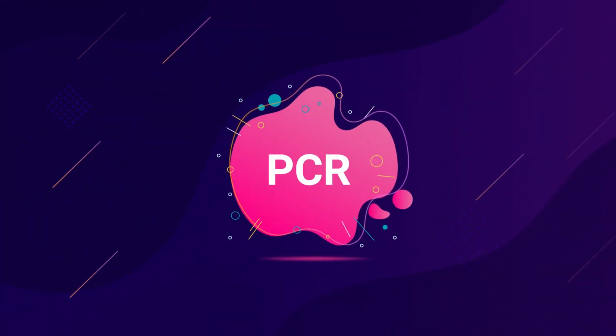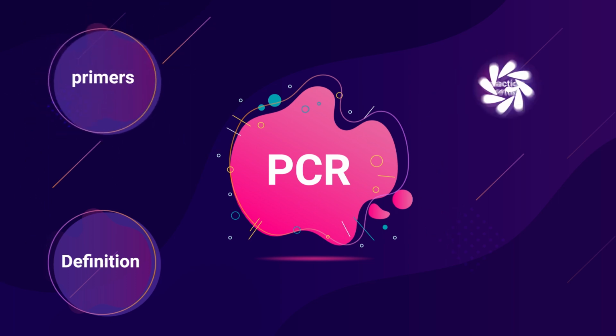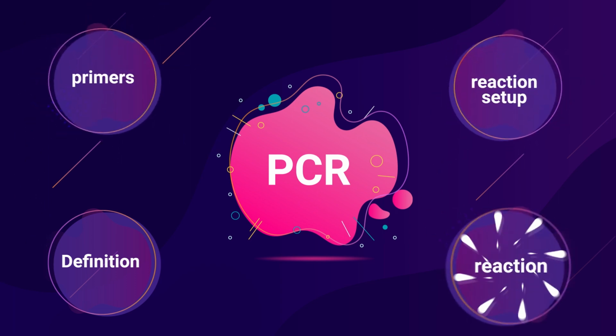We have discussed in this video the definition of polymerase chain reaction, PCR primers, PCR reaction setup, and PCR reaction.